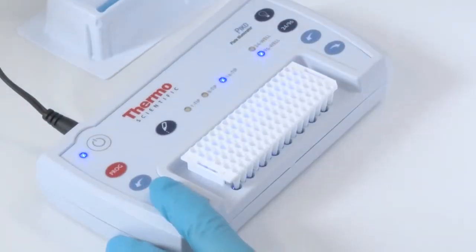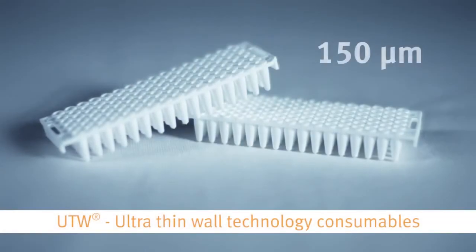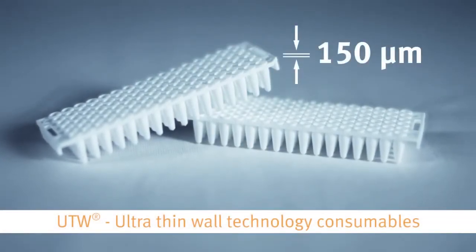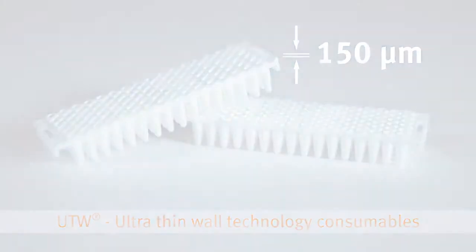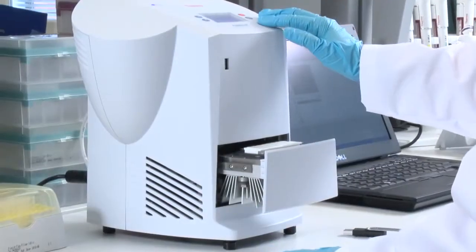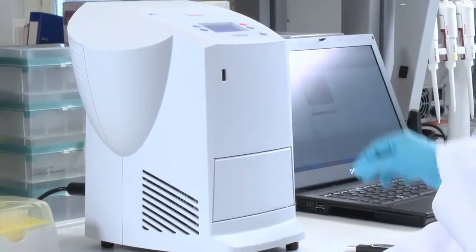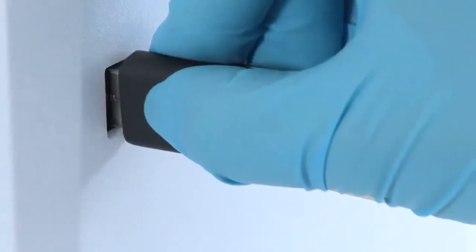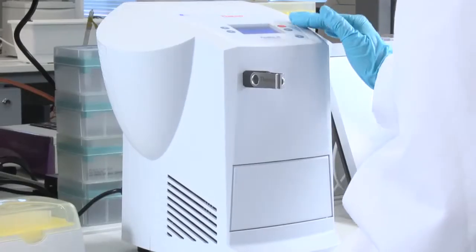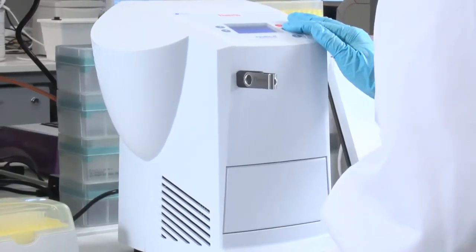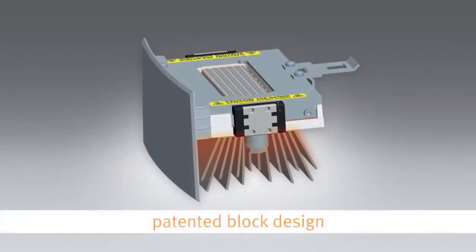The Pico plates utilize ultra-thin wall technology. The wall thickness is only 150 micrometers, allowing fast heat transfer between the block and the sample. PicoReal can be controlled with computer or using a USB flash drive for protocol loading and storing data. Just insert the USB stick to the instrument and pick it up after the run for analysis.